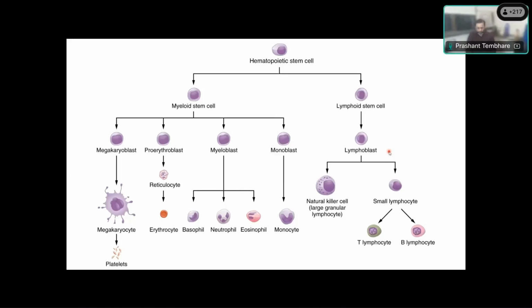Okay. Great. Now, if you look at the hematopoietic system, we know how it grows. Sir, there is one question. Why do we do gating? Okay, gating, will come to that.